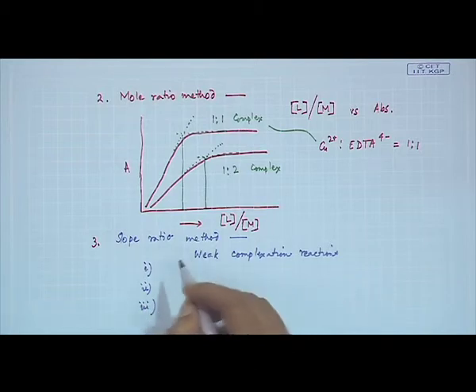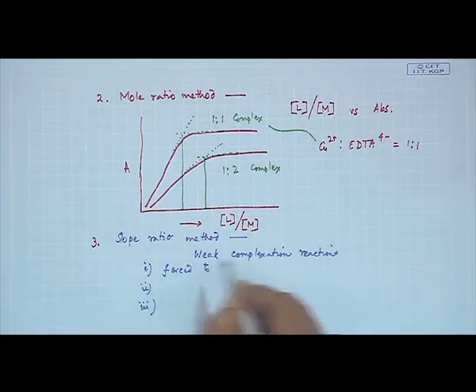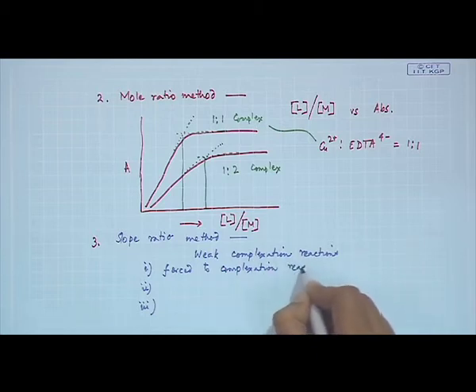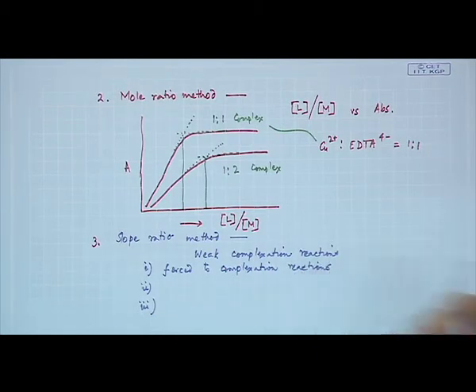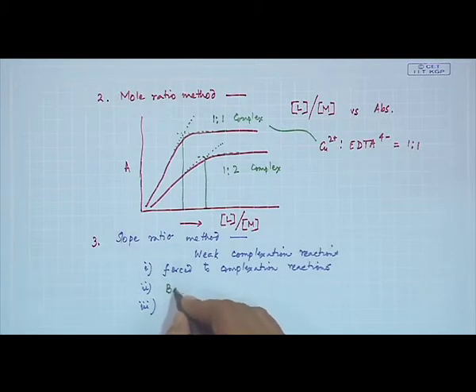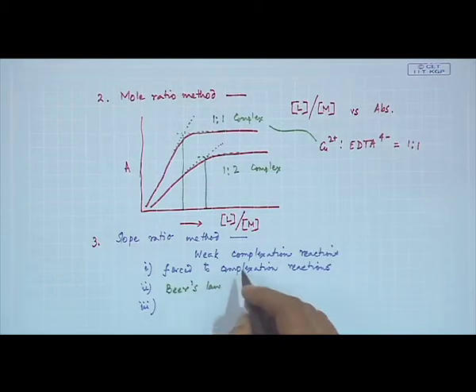Obviously it has some important things to remember: when we add ligand, the complexation reaction is forced, and that we want to monitor. In this particular case we should also have Beer's law followed, otherwise we cannot use this process.